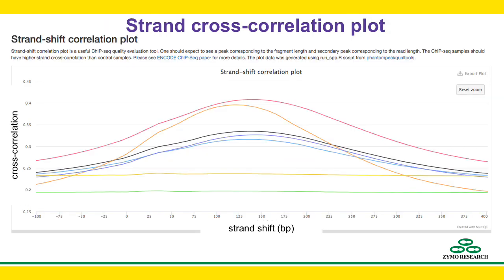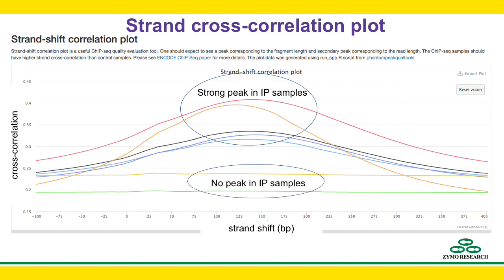If you plot the strand cross-correlation against the number of base pairs shifted, you get a curve like these. For a good ChIP-seq experiment, you can expect strong peaks at around the length of the IP fragment. For control samples with input DNA or IgG, you should get almost no peaks. It is also possible to see a secondary peak at about read length, especially in an experiment where the main peak signal is weak. There are also numeric measures of this curve, known as NSC and RSC scores, which are widely used in ENCODE projects. You can find more details in our sample report.